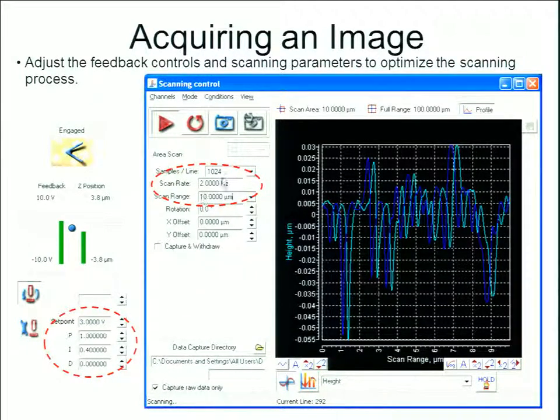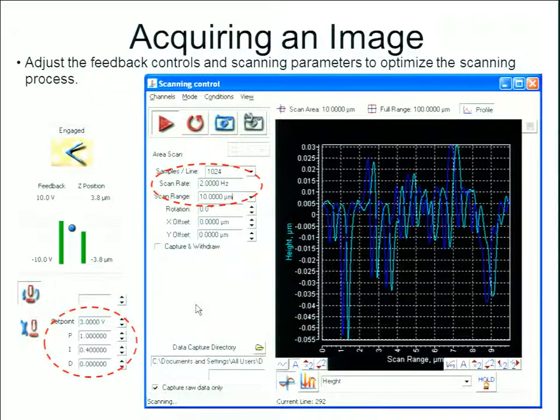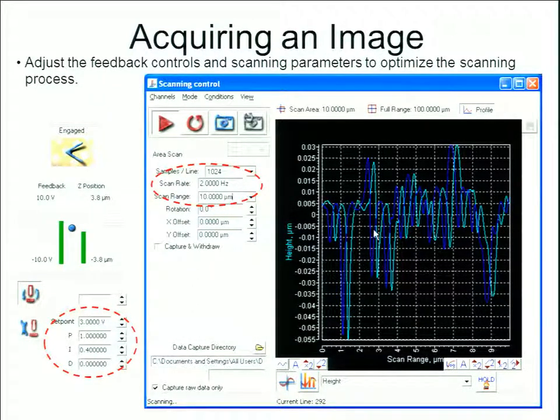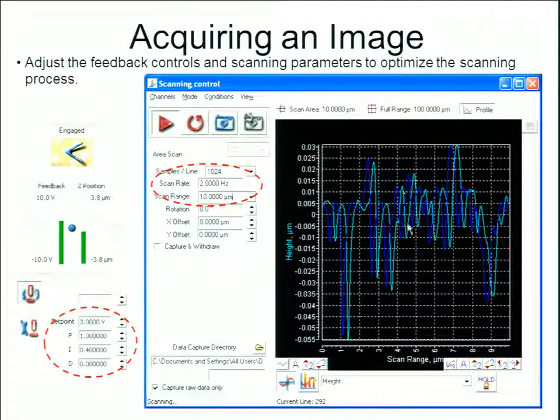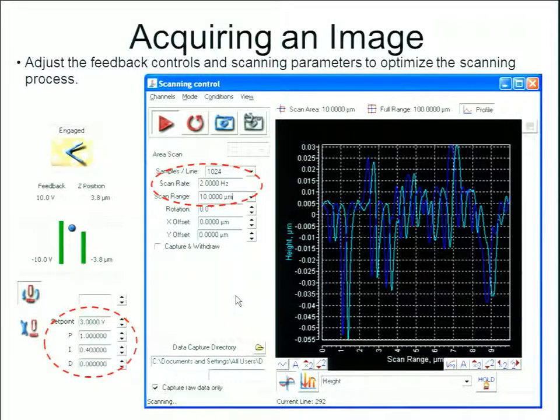When ready to scan, choose the samples per line, scan rate, and scan range. You can also manipulate your set point and PID controls of the feedback loop. While actively scanning, you'll see a profile showing the forward and backward traces. The SPM scans forward and backward along the exact same line — this helps you notice differences between the two scans so you can adjust your feedback loop accordingly until they match more closely.